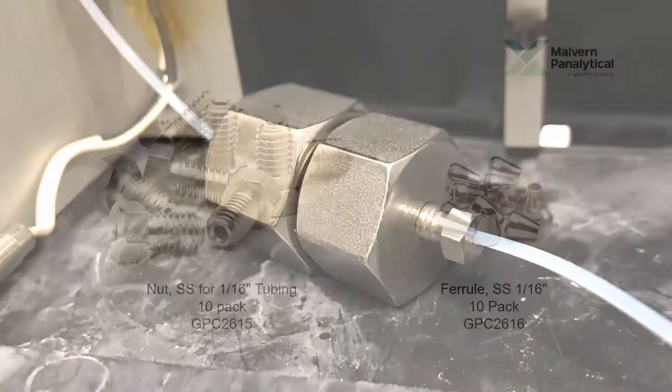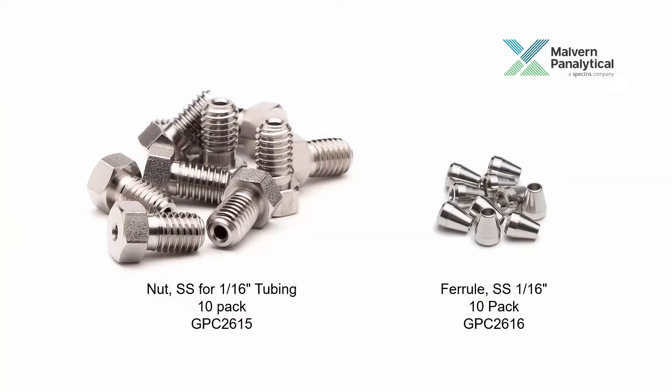Most of these connections utilize a nut and ferrule fitting on the end of a piece of tubing that secures into a specifically shaped socket to minimize dead volume.